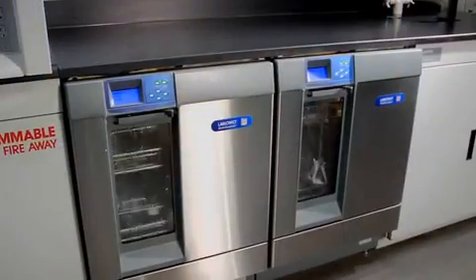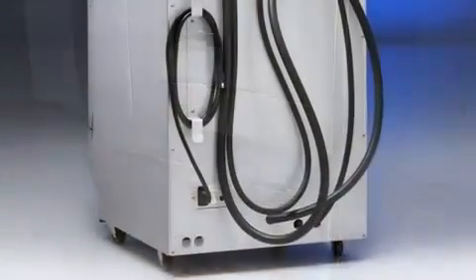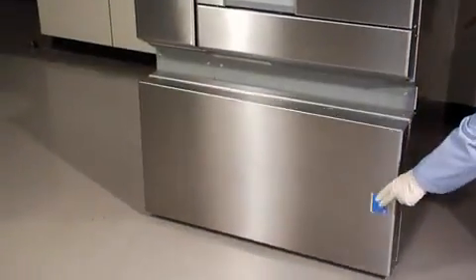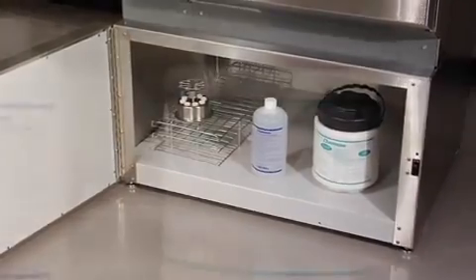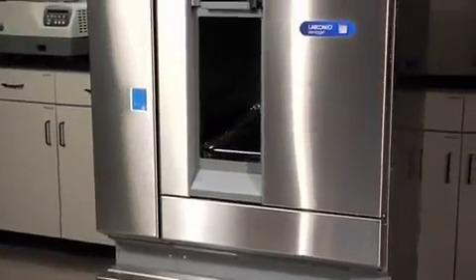The Steam Scrubber and Flask Scrubber come in under-counter and freestanding models. The Flask Scrubber Vantage is a freestanding model that may be easily converted to under-counter. A mobile kit is available on freestanding models. The accessory base stand has an interior compartment for storage of detergents, racks, and inserts, and elevates freestanding and mobile washer models for more comfortable loading and unloading.